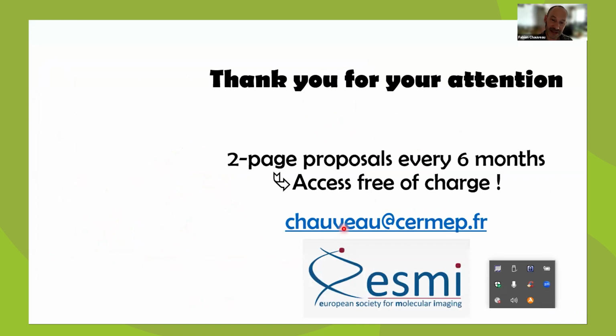So this is my final slide. For the moment, to perform XPCT, you have to go to the synchrotron. And from what I showed you, you may have the idea that it's really complicated to go there. It's actually not. Every synchrotron has a call, which is launched every 6 months, and what you have to do is write a 2-page proposal. Of course, for that it's good to first get in contact with beamline managers so that they guide you. But if your project is selected, then the access and the beam time are free. So it's not that difficult, and it's actually not an expensive technique.